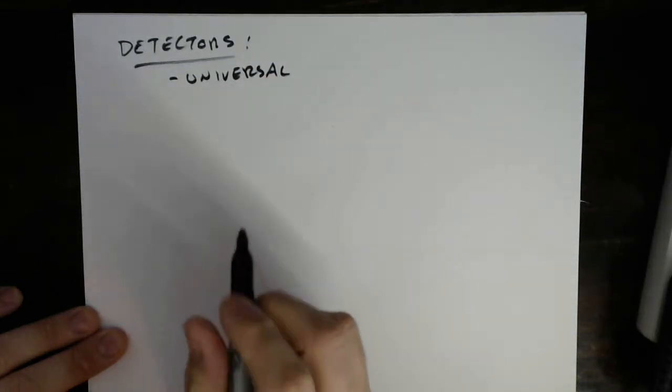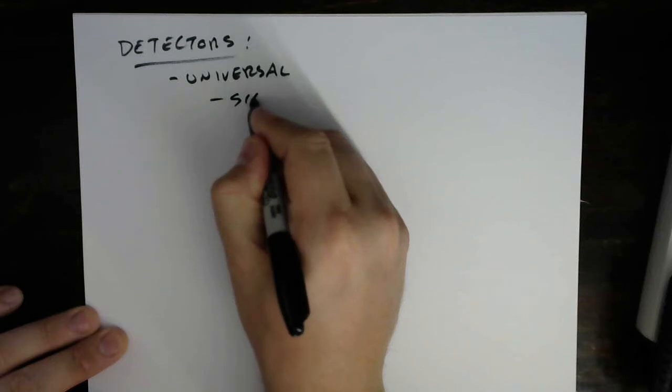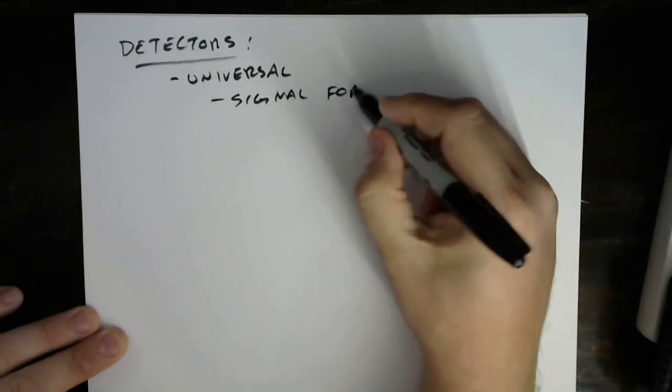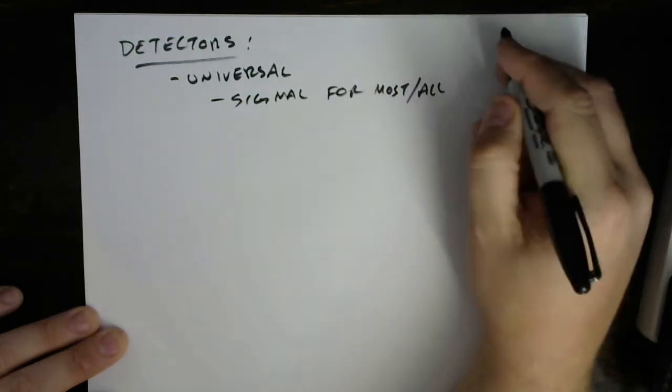Universal is going to give a signal for most or all analytes.